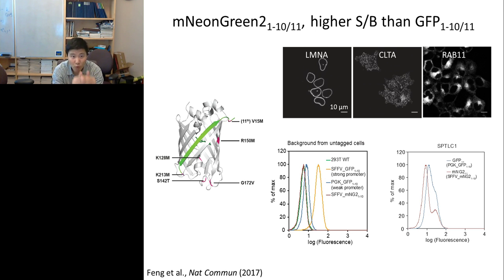And it's a very weak fluorescent background, basically on the same order of magnitude compared to the autofluorescent background. So it never affects other powerful applications of the split GFP, GFP11 system. But in our case, we're trying to detect a low expressing protein. This becomes an issue because the background is higher.